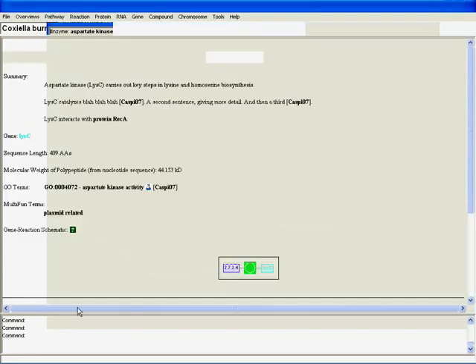And I'll just get rid of that because I don't feel like doing that right now. And the last thing here is that you can use the spell check to do exactly that, check your spelling. But let's close this for one more moment.